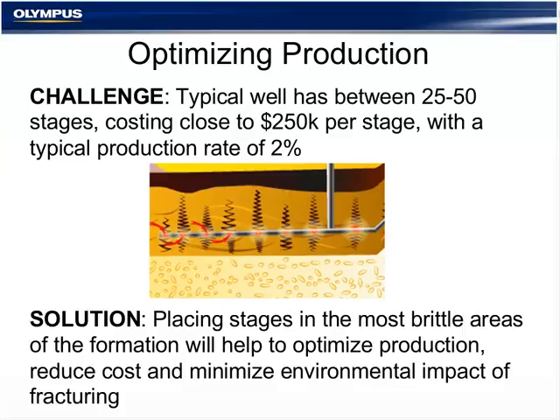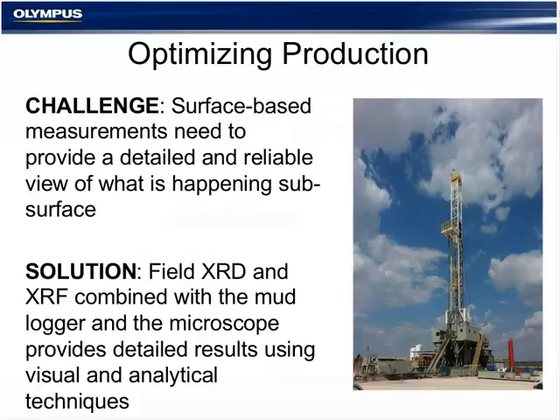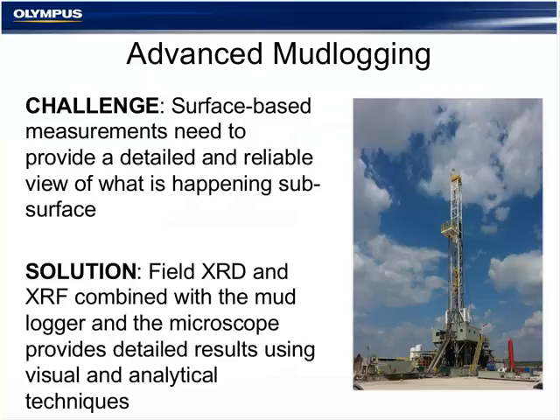I'm really big on expressing that XRD and XRF at the well site do not replace traditional core analysis laboratories, but instead complement them as a screening tool. X-ray measurements on well cuttings are simple tests that look deeper into the rocks with more precision than observation alone. It doesn't replace the human on site because observations on color, texture, grain size are indispensable. XRD and XRF complement the mud logger, offering a precise quantification of the minerals, and that data is logged next to the visual descriptions and engineering data.